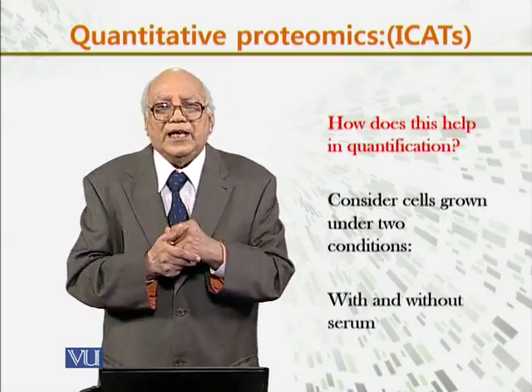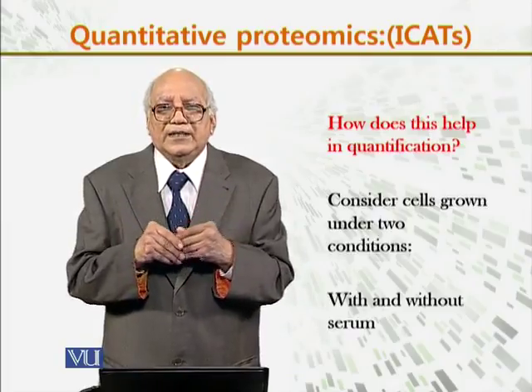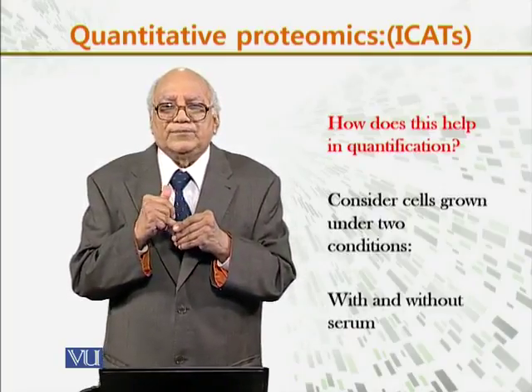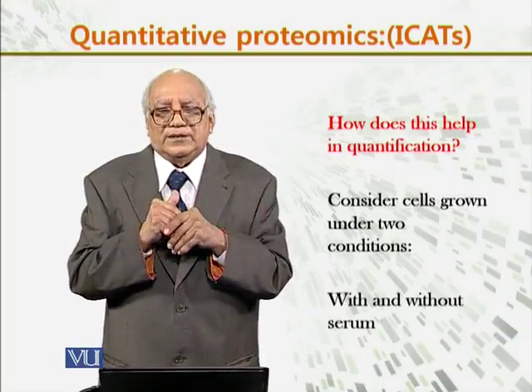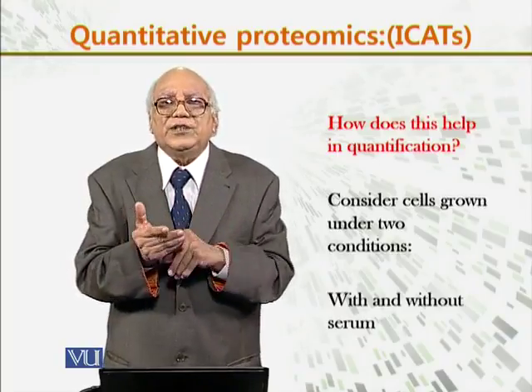Now, how does this tag help to quantify the protein? Just consider a cell grown under two conditions: with serum and without serum.